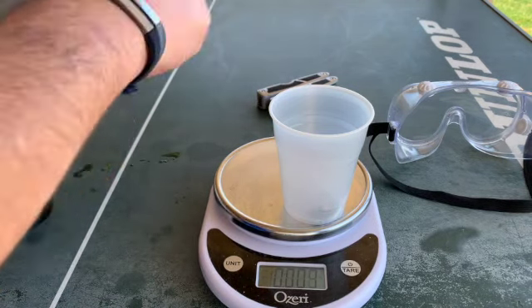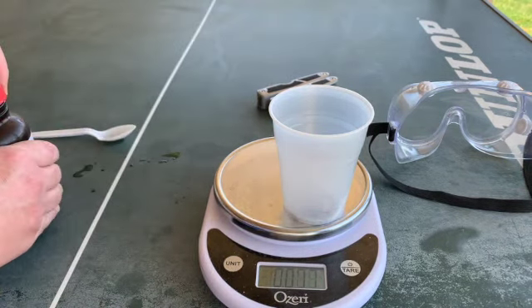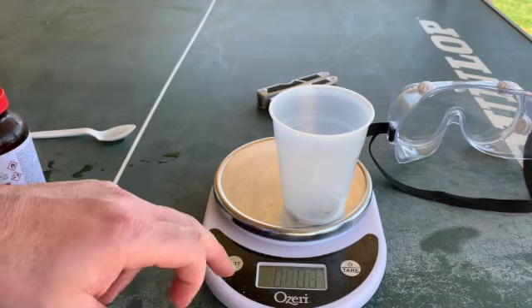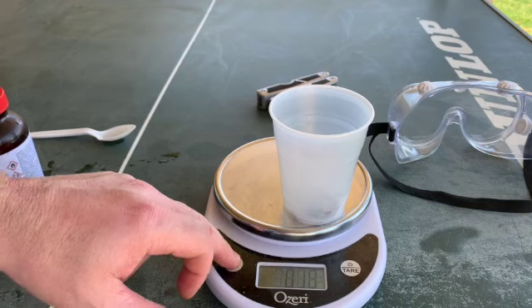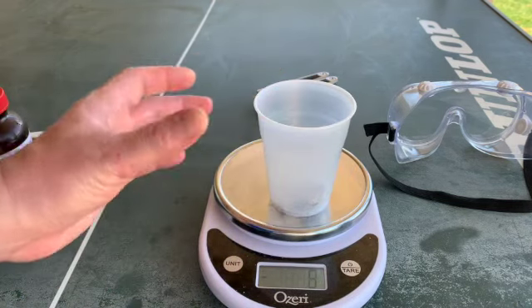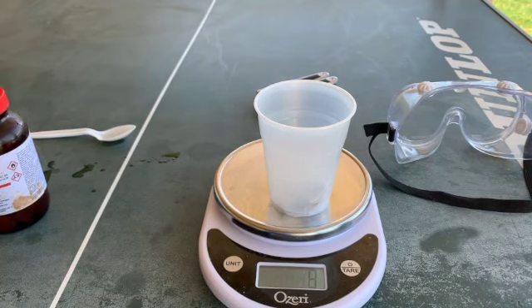I have the electronic balance set to pounds right now, so I'm going to switch it here in the video, and we're going to switch it up to grams. It's going to give us about 5 grams of sodium that you're going to see in there. You can see that on the balance. It's hovering around 4 to 5. Not a real good electronic balance. It's a food scale from our kitchen, but it works. Okay, so we're about 5 grams.